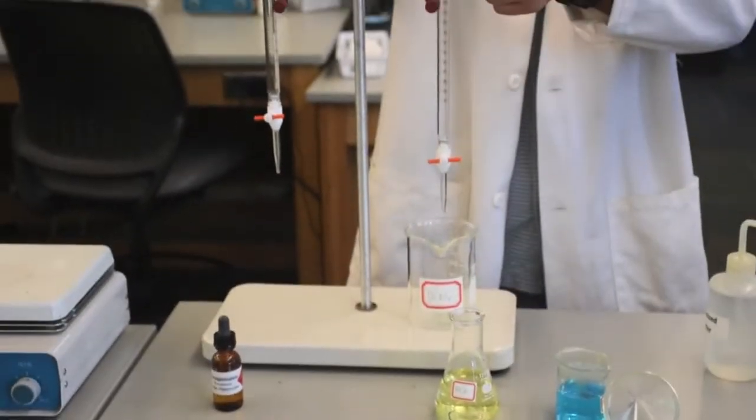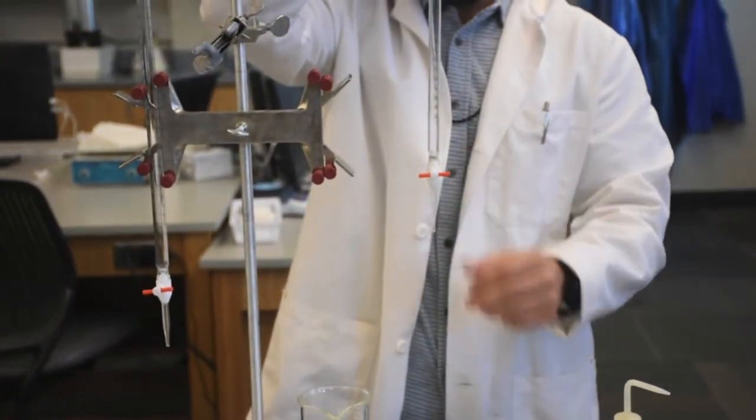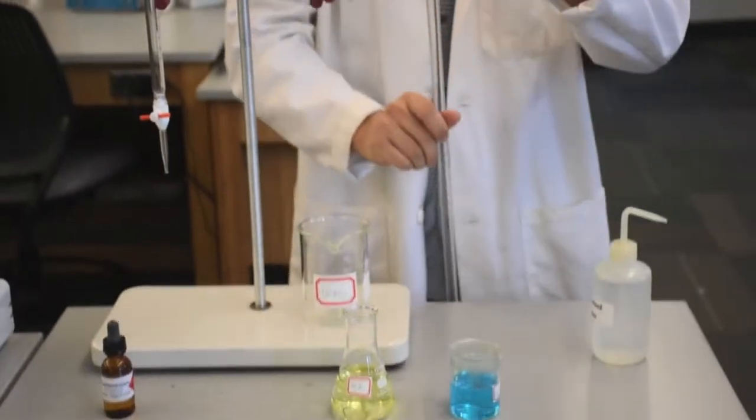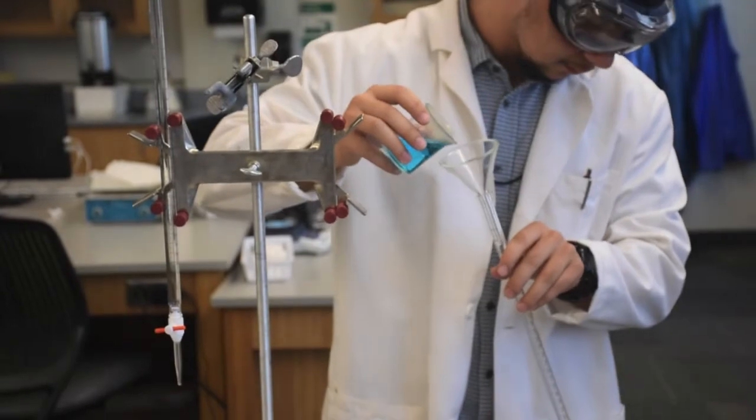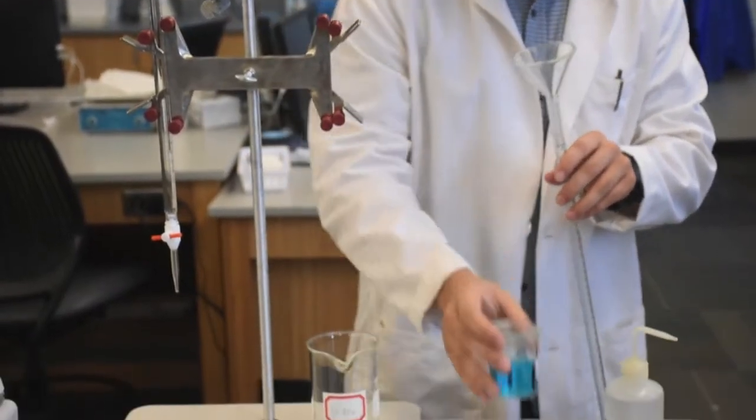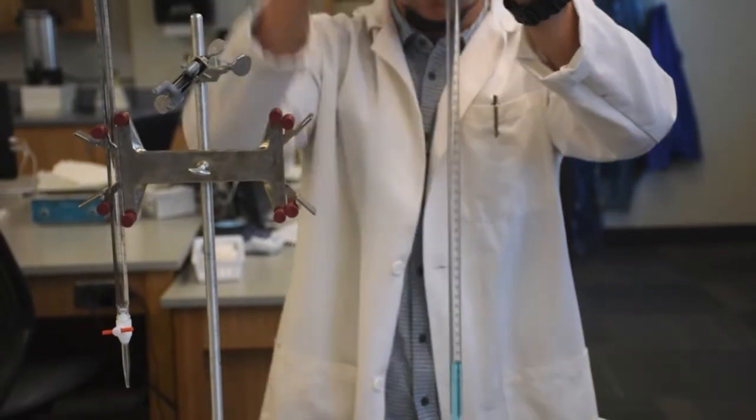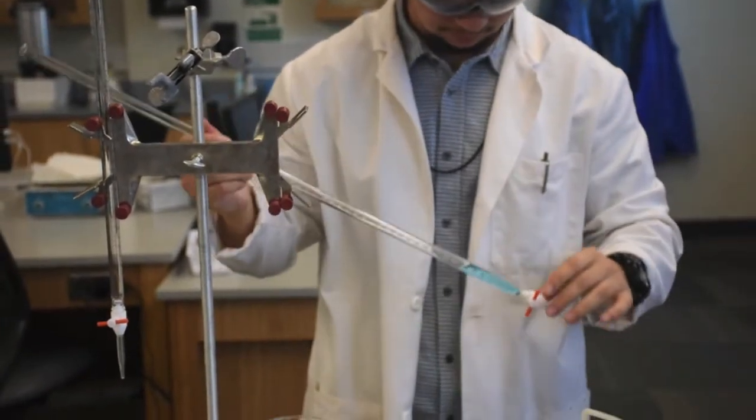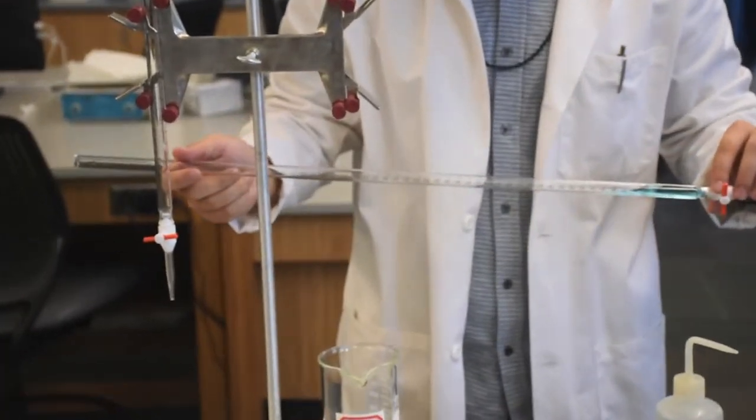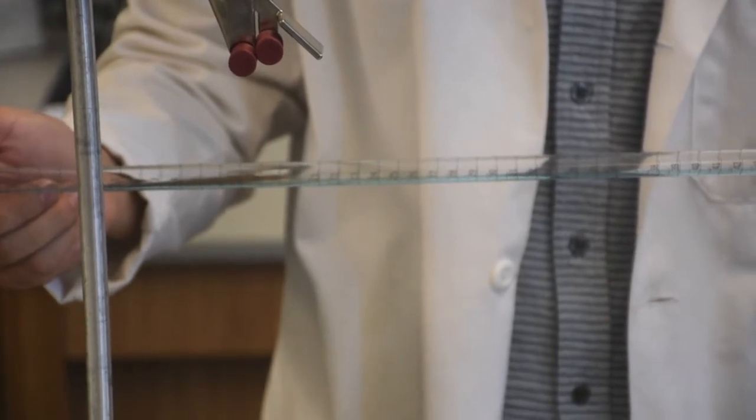Let's now coat the inside of the burette with the titrant. Make sure the stopcock is in a closed position with the stopcock perpendicular to the glassware. Pour about 5 ml of titrant using a long stem glass funnel into the burette and hold the burette on its side. You do not need to fill your burette to the top just yet. Using your hands, rotate the glassware providing maximum coverage for the titrant to coat the inside surface of the glassware.